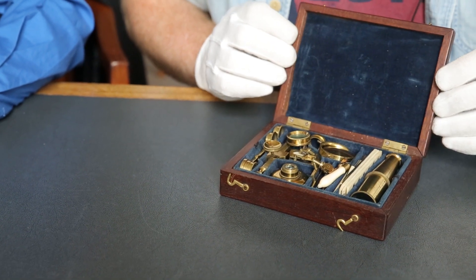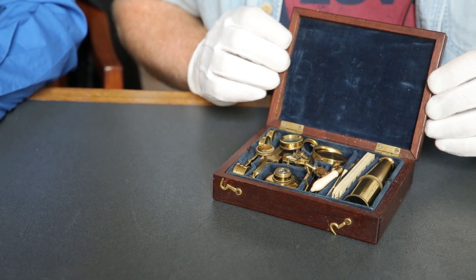Oh wow! This is a microscope — it's a field microscope, so it's something that you would carry around with you in a box if you're a naturalist or a physician, and you could use it and assemble it in the field to look at anything that you wanted to. Like a portable microscope? Portable microscope, absolutely.